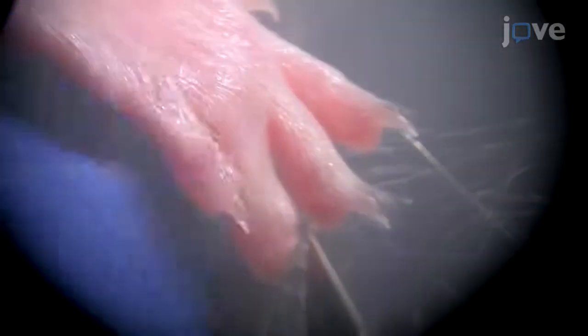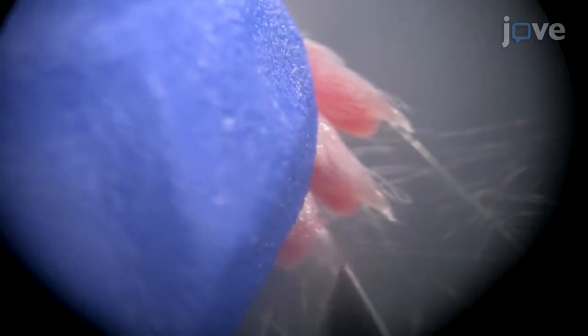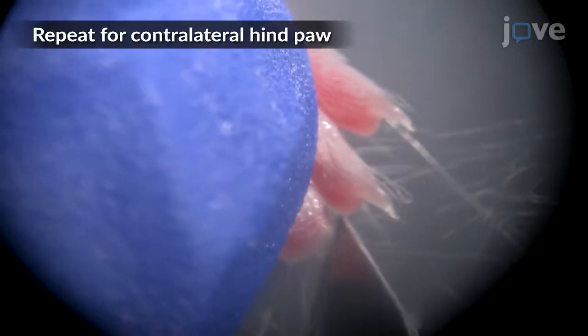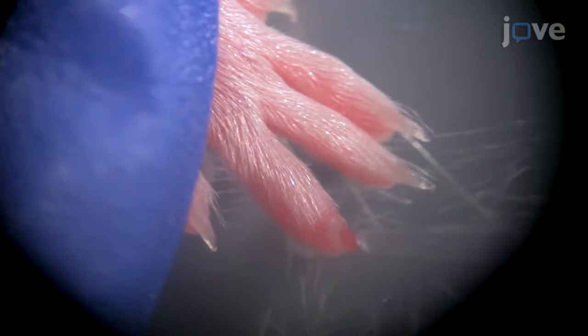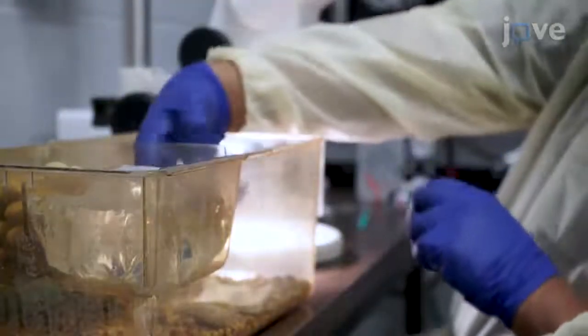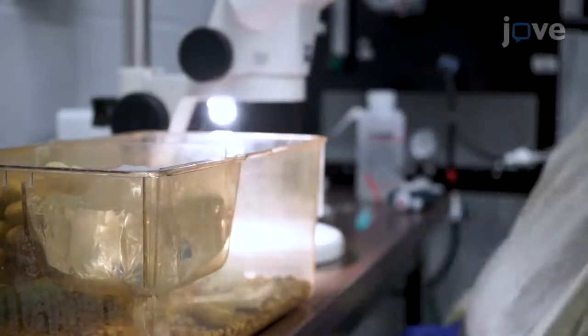Holding the scalpel at an angle parallel to the fat pad, use a sterile number 10 scalpel to amputate the distal tip of the terminal phalanx of digits 2 and 4. Apply one additional microliter of bupivacaine locally to each amputated digit and return the mouse to a clean cage to allow the wounds to heal without wound dressing and with monitoring until full recumbency.